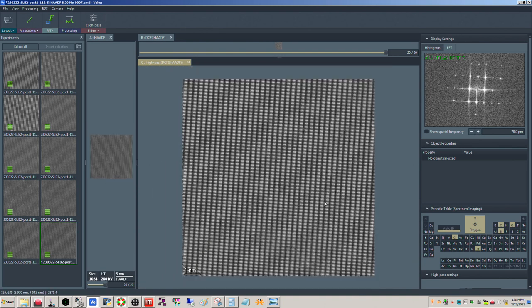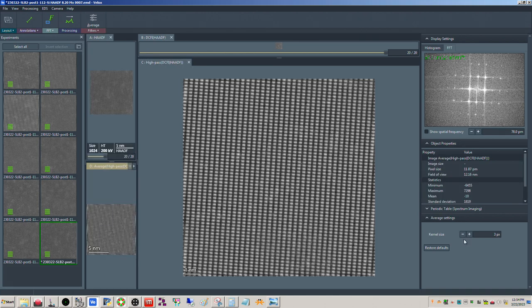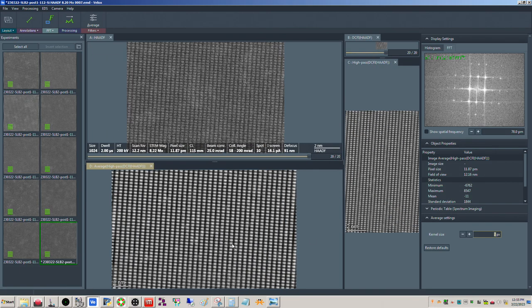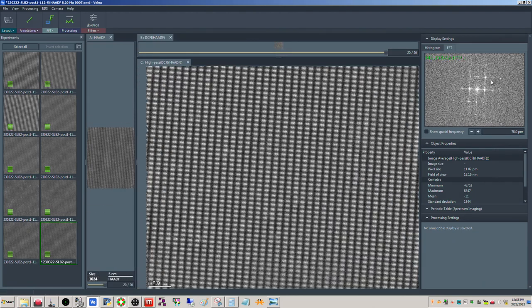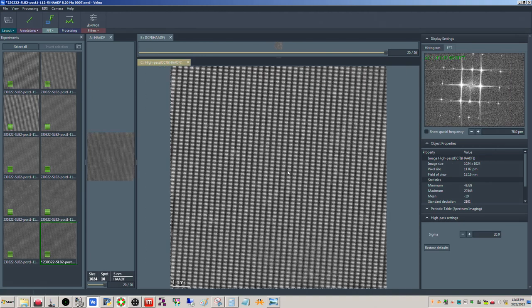One thing we could try doing too, I don't know how much it'll help, is if we average it. I don't know if that's going to really, no, not terribly. You can still see it there, but this is about as good as I would expect. Let me get this off here. Wait, no, this is the averaged one. Okay, we'll delete this one. But there it is: 78 picometers here at 200 kilovolts.